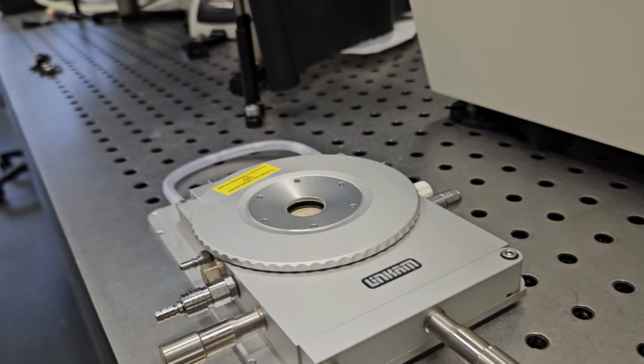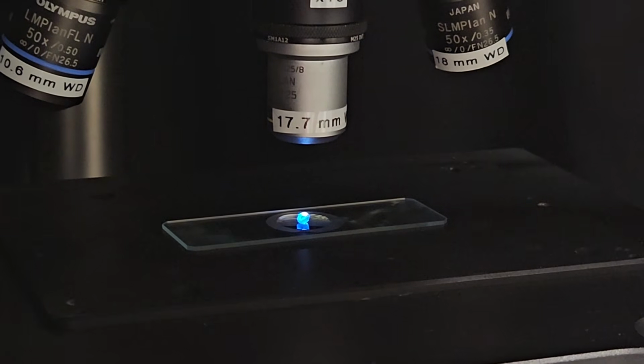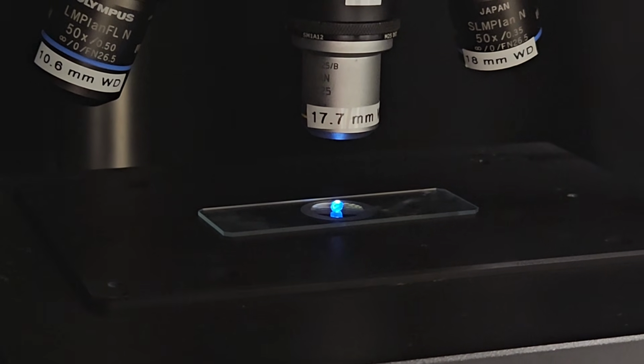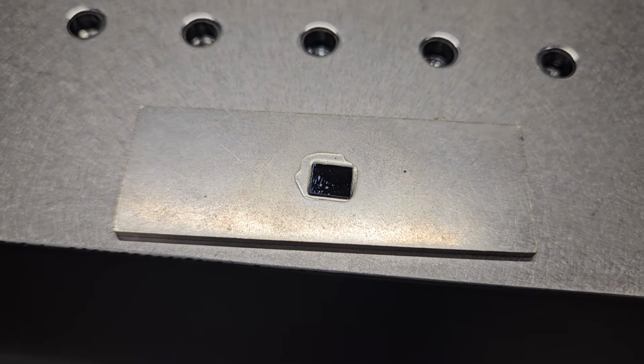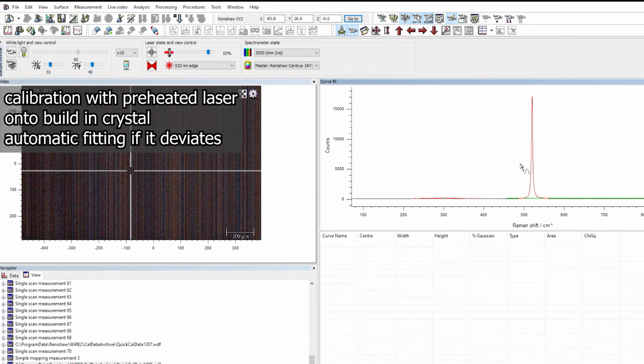I simply used a crystal which I found during another field trip as an example. Well, I'm quite certain that this video will come up before the actual field trip. Before taking any measurements, the laser needs to be recalibrated against one of the internally mounted silicon crystals. Once the optical focus has been set, the laser itself can be refocused.